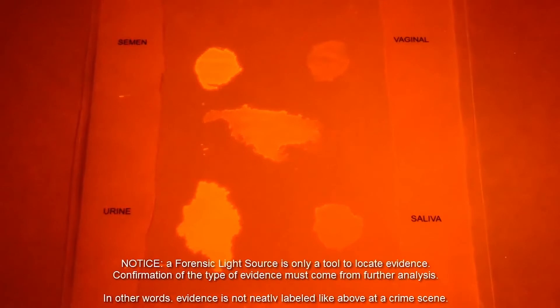The purpose of switching wavelengths is to reduce background fluorescence, which will allow you to find potentially missed evidence and provide a better contrast in the evidence that you are visualizing.